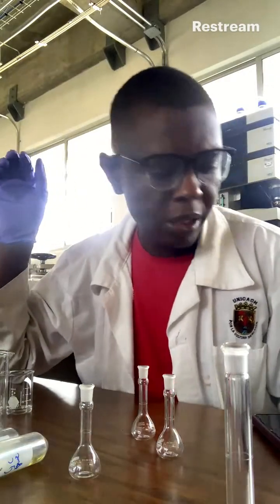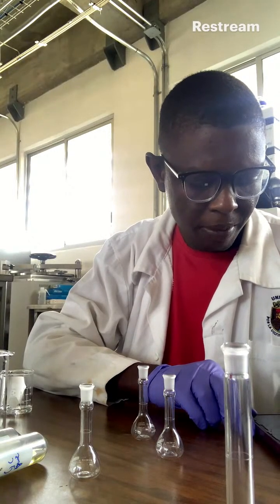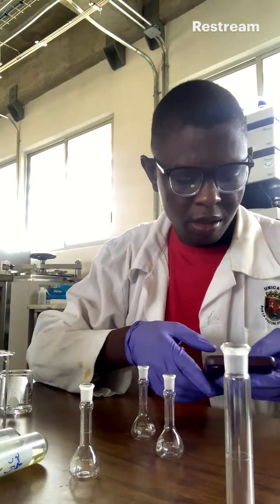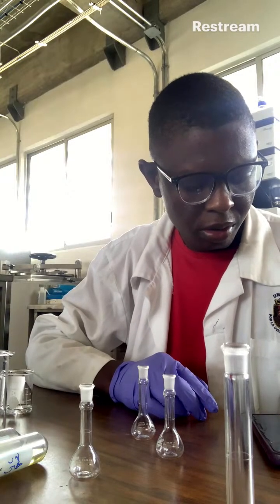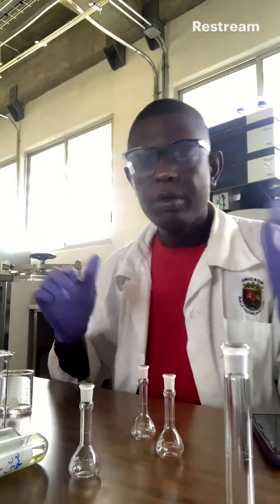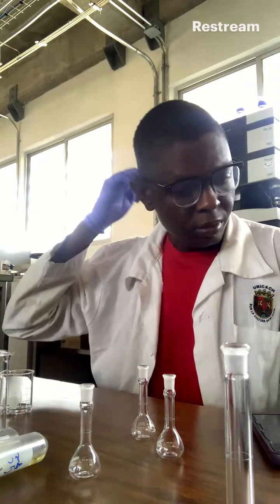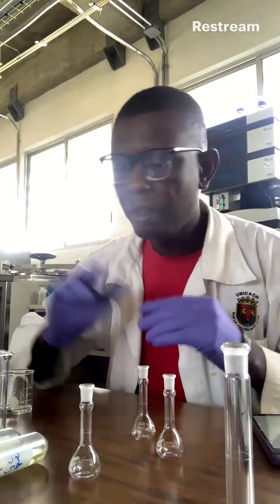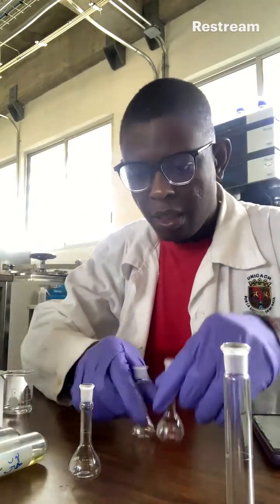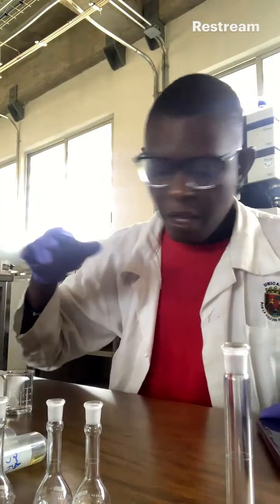All right, so I want to be preparing my sample. Without wasting much time, these are the volumetric flasks I have, and I have already gotten my standards.